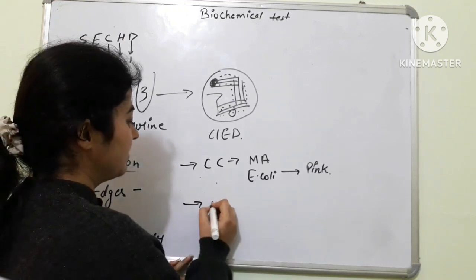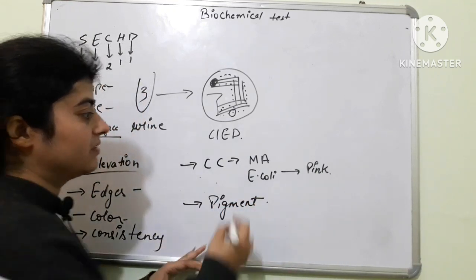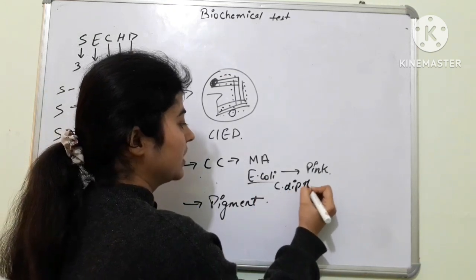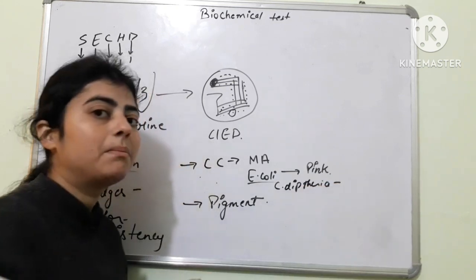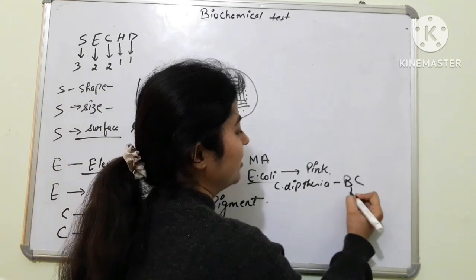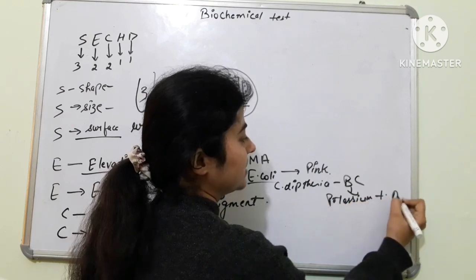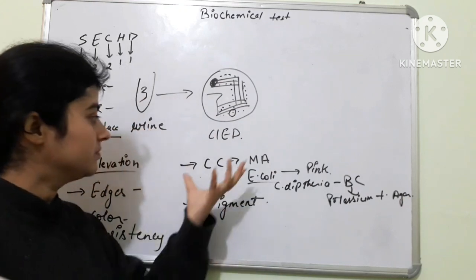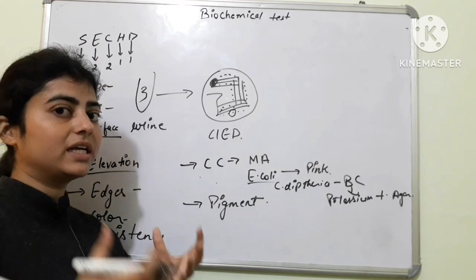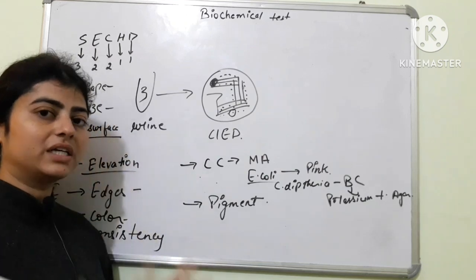One more example you can write, Corynebacterium diphtheriae. Corynebacterium diphtheriae produces black colored colonies. Can you imagine black colored colonies on potassium tellurite agar? So this is whether your colony produces color or not. It is also one of the parameters to select the proper colony for further diagnosis.